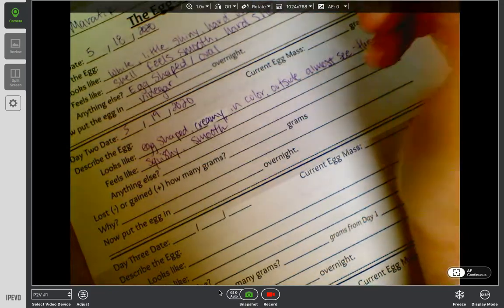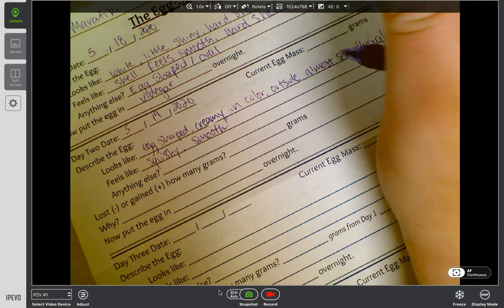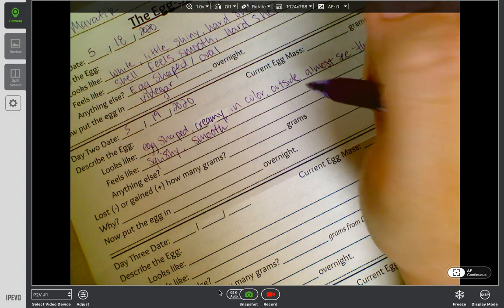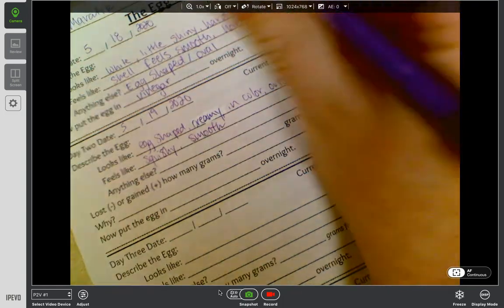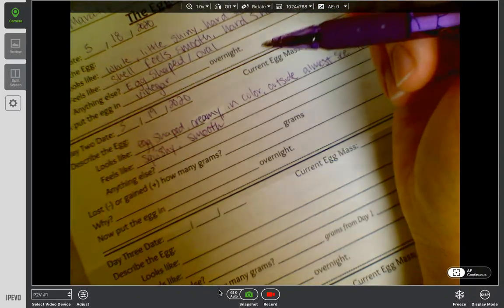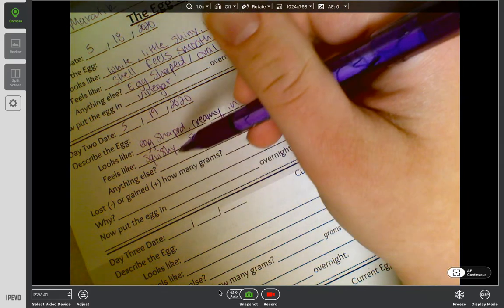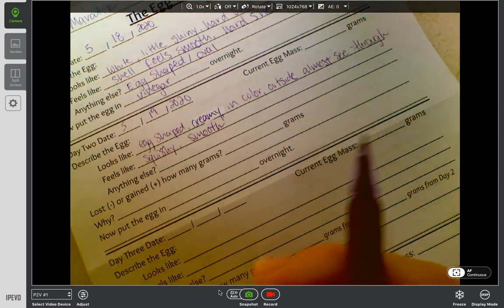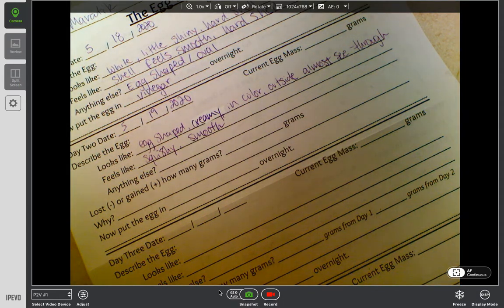Now, note, you want to be careful with this because even your fingernail, when they tear off or something, could actually go through the membrane. So that's why we want to be careful with it. But it's squishy, it's smooth. If you have anything else you want to add to it, I've always got a few people, as I'm looking at it, I'm like, I think I've got everything. But if you have other things you wanted to add to it, you definitely could.